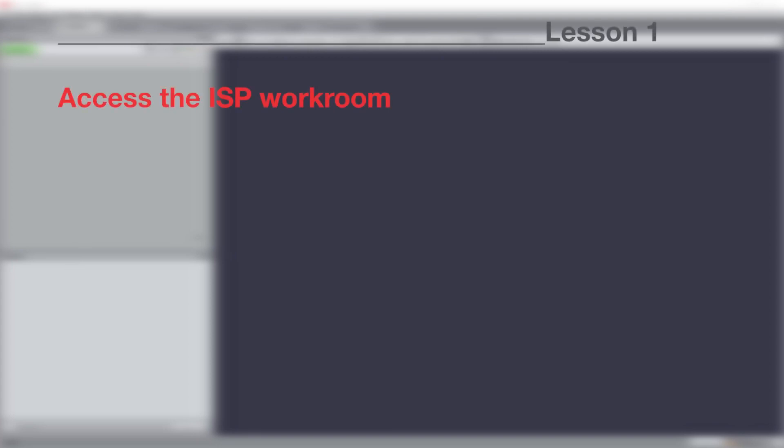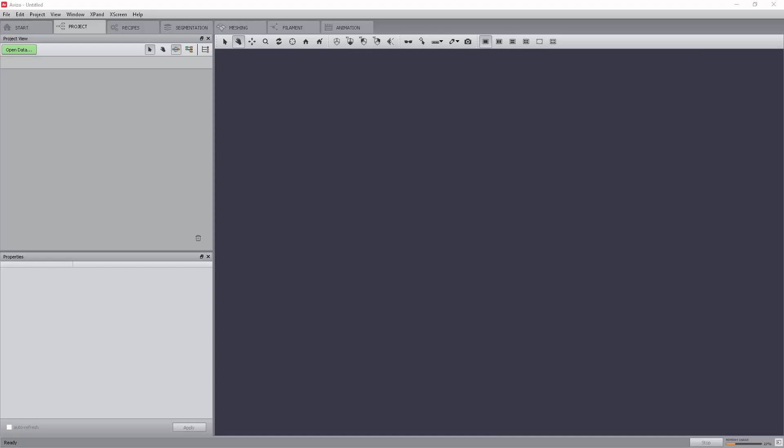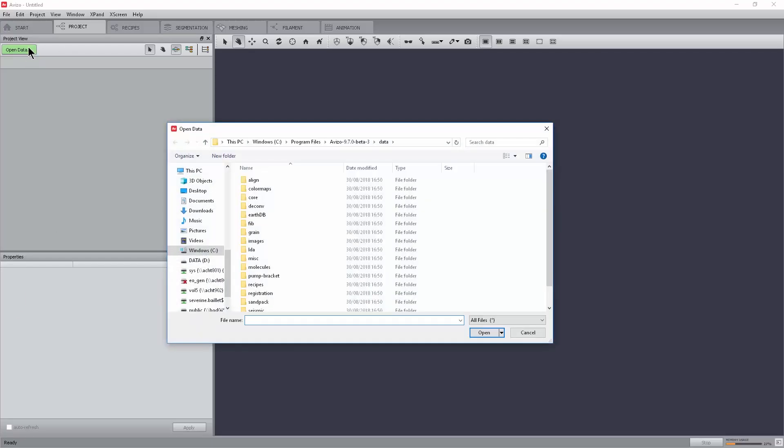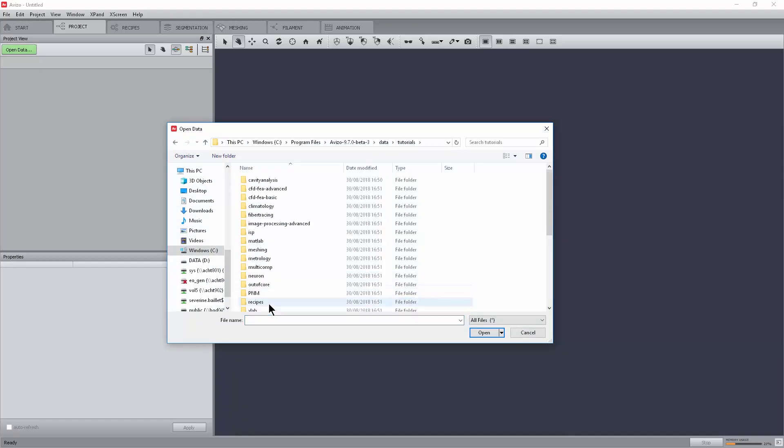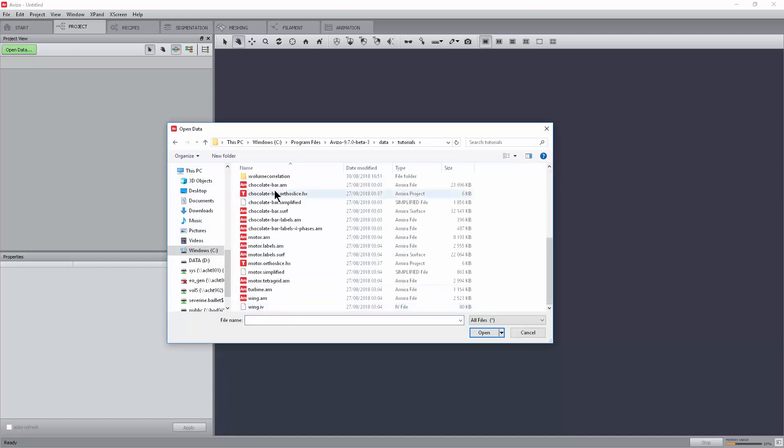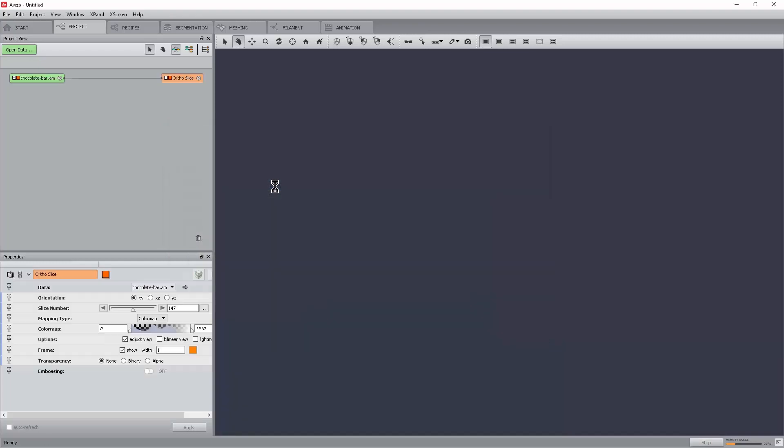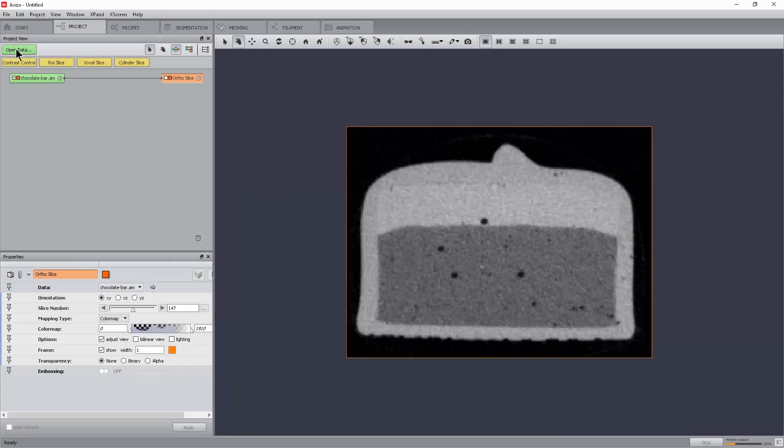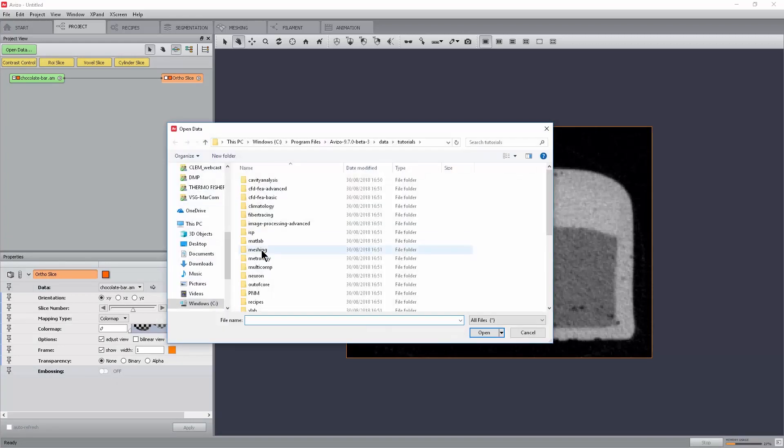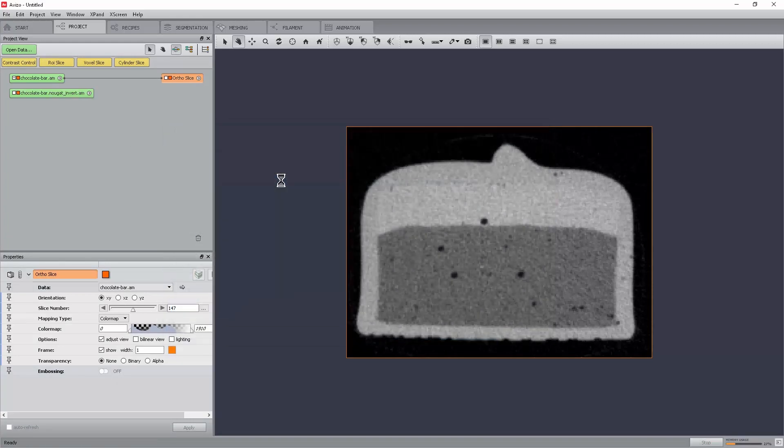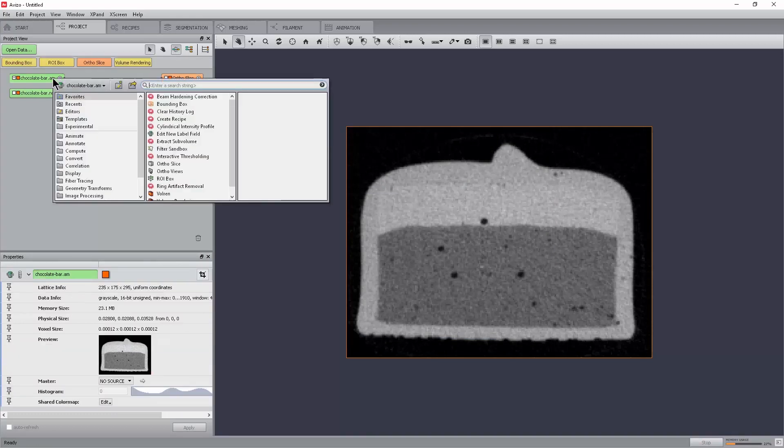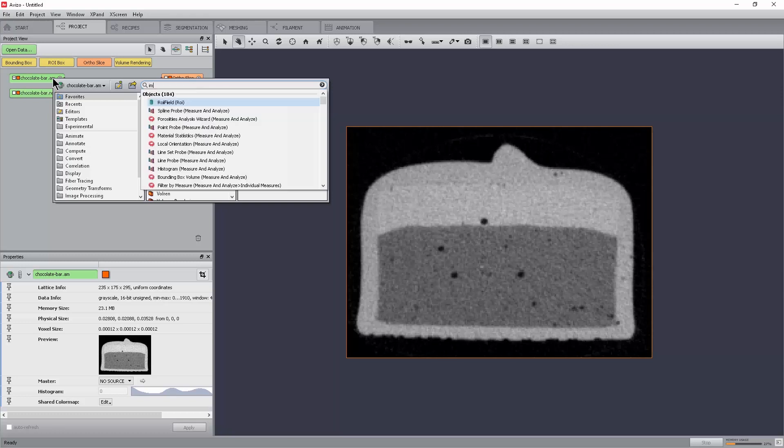First, we will see how to open the Image Stack Processing Workroom from the main project workroom. From the main Aviso project workroom, open the data chocolatebar.am from the Tutorials folder and chocolatebar.nougat.invert.am from the ISP folder. Right-click on the chocolatebar.am data module displayed in the pool and select Image Stack Processing from the object pop-up.